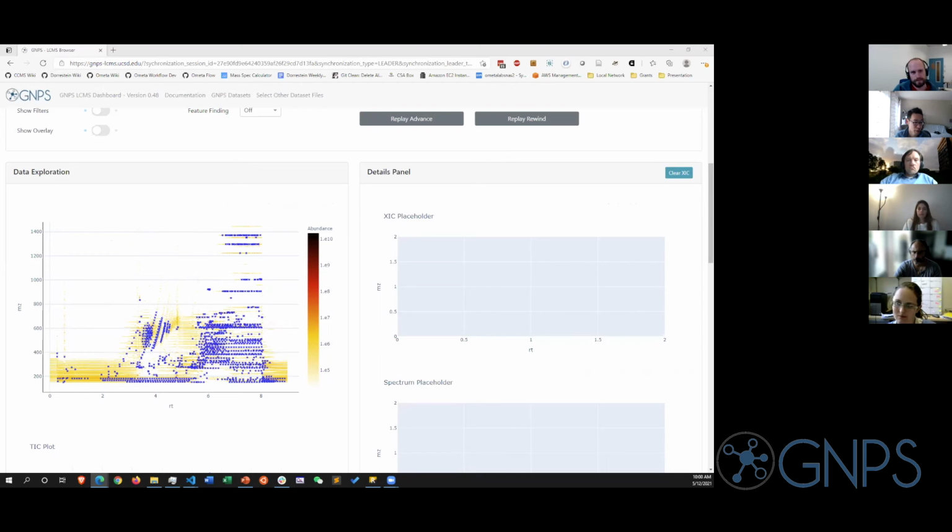Oh yes, that's a good point. It does work on phones. The funnest part when we were developing this, between me and Daniel, is he would link me to some new data he acquired, and we're in the pandemic, so I wasn't actually out, but I was laying in bed, and I was able to click the link that he shared on my phone and make at least some observations directly on the phone. I thought that was really cool. If you're in a boring meeting and you ever want to look at data. Anyway, that's a side point. But was everybody able to get on the website, barring any crashing issues?